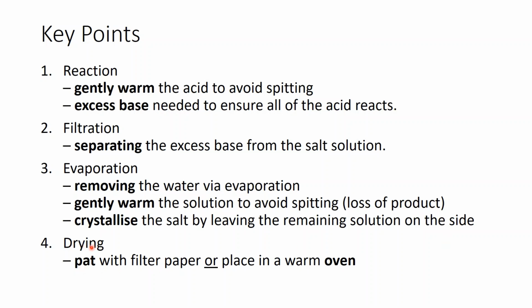And the final step is to make sure that those crystals are nice and dry, either with patting it with a filter paper to ensure that it's dry, or to place it in a warm oven, as we saw in the video this time.